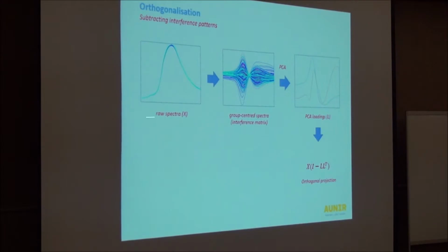So we project the original spectra orthogonally onto the loadings of the perturbation subspace. So it's the equivalent of removing dimensions that are irrelevant from our data set. This is that equivalent. And that's what happens. From this, you end up with this.